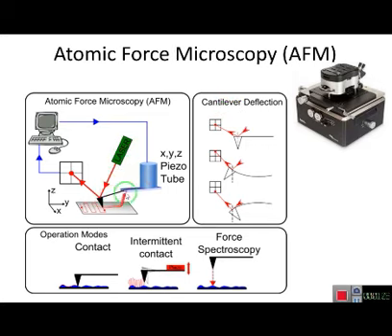And the main feature of this microscopic technique is the cantilever. You can somehow consider it as the fingers of the blind people. It will move on the XY plane of our sample and feel the structure, the outer shell of our sample.